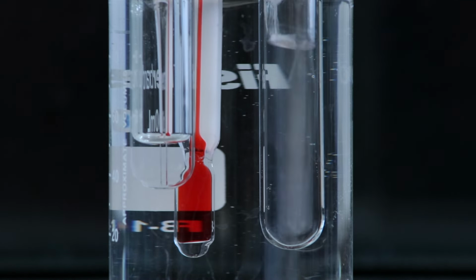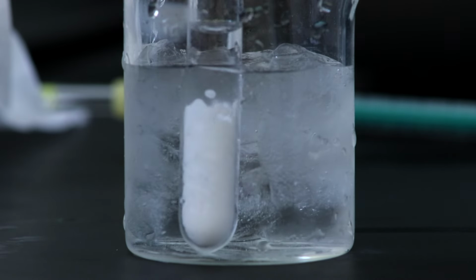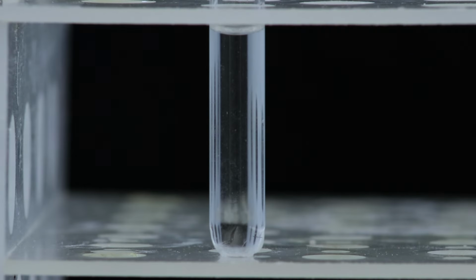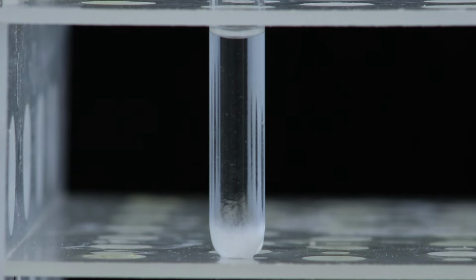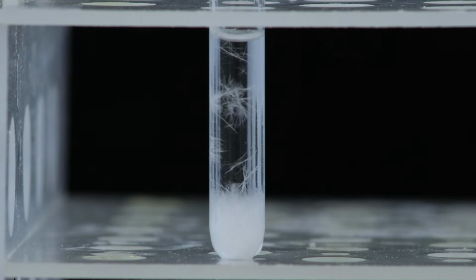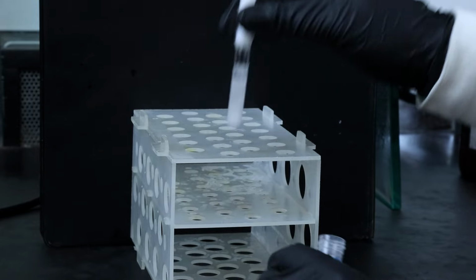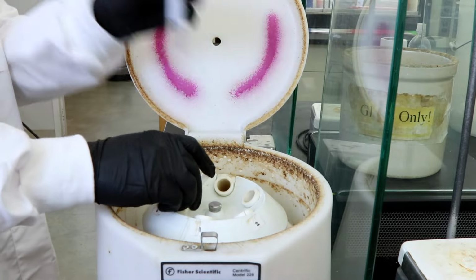Once it's fully dissolved, I'll confirm that it can still come out of solution in an ice bath, which looks like it still can, so I'll redissolve it in the hot water bath and then leave it at room temperature so that the alcohol can recrystallize slowly. I'll remove those crystals using a stopper and polypropylene test tube, and I'll place it in the centrifuge for a few minutes.